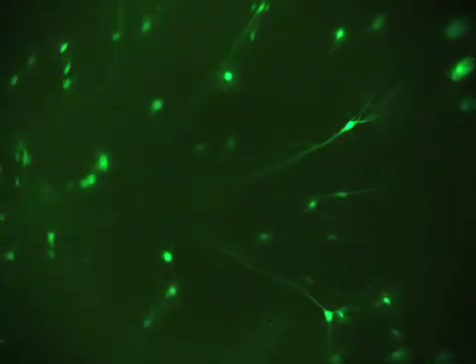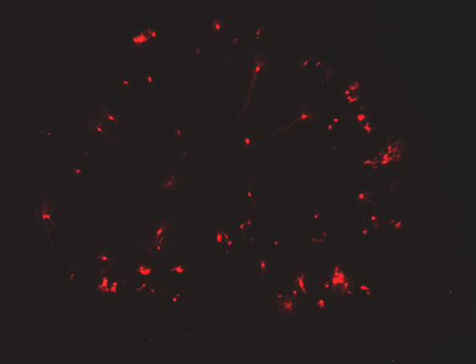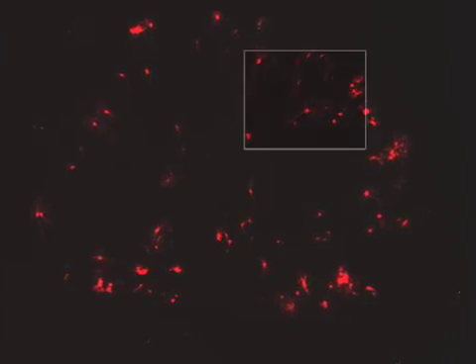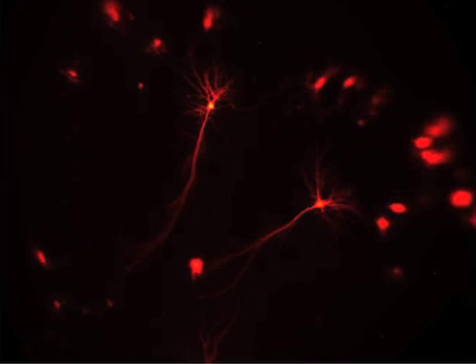Now let's have a look at some of the transfection results. Even for a standard hippocampal slice preparation, there can be a fairly wide range of transfection efficiencies depending on the bullets and the slices. Generally, a relatively low transfection efficiency is desirable in order to obtain nicely isolated transfected neurons.